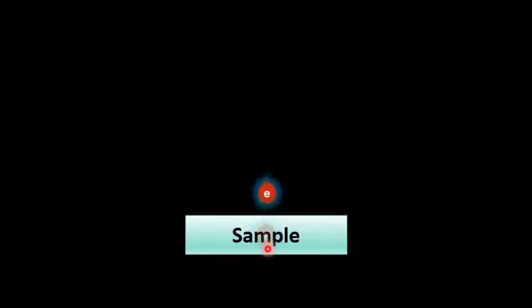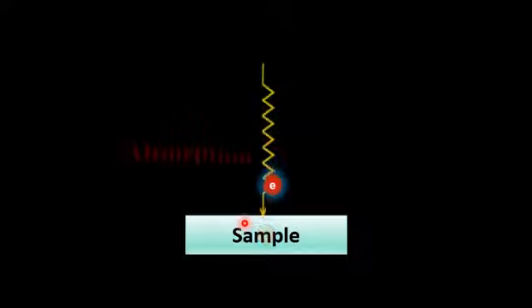These absorbed electrons are also used to study the electronic and electrical properties of the sample. So the absorbed electrons in a sample, due to the interaction of the energetic beam of electrons, can give you information about the electrical and electronic properties of the matter.